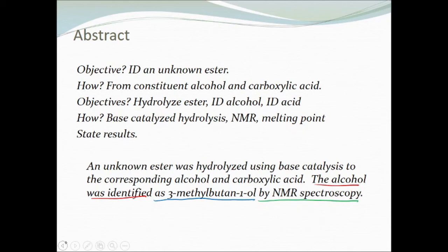And one of the results that you will be reporting, of course, is the percent yield. We do not report the mass yield, since that is kind of meaningless. Without knowing the scale we're running it on, we don't know if 1 gram is a good yield or a poor yield, but we do report percent yield. We do not need to report how we determined that, since that should be intuitively obvious to a student at your level.